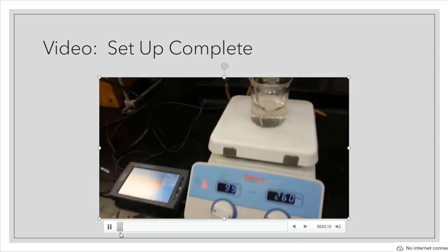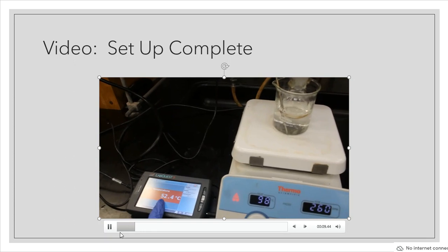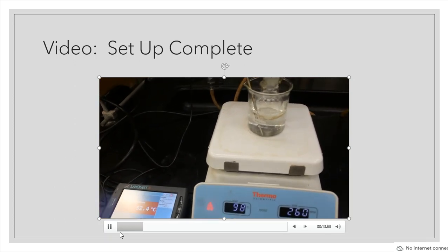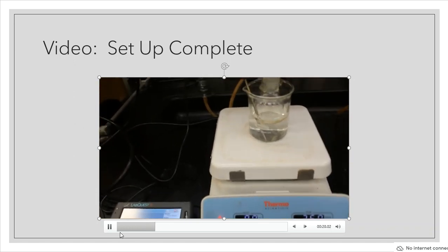Okay, so this is the setup for the trans-cinnamic acid. If you can hear me over the fume hood that's running in the back. Here I've got my thermometer probe that's constantly recording the temperature of the water bath. I've not added the bromine yet. It tells me 50 degrees, and right now I'm sitting at about 52, so I'm close enough.